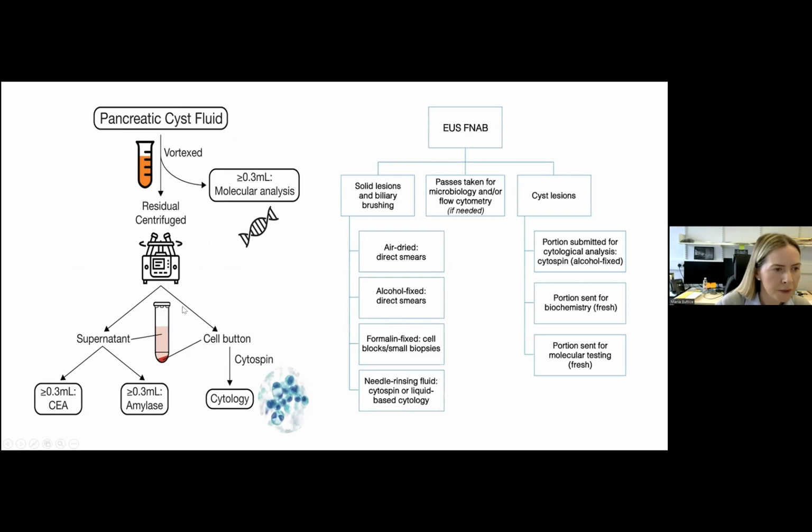Now, often with the cytospins, our cytology will often show features in keeping with cyst fluids, such as hemosiderin-laden macrophages, blood, and amorphous debris. And often these are paucicellular. So in isolation, they are often inadequate or insufficient to make a precise diagnosis, okay?